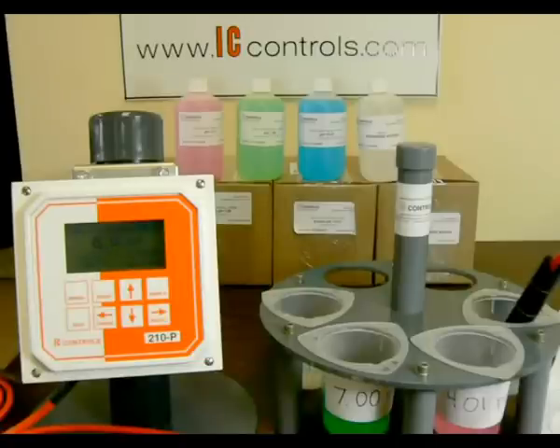After the pH buffer solutions have been used for calibration, IC Controls recommends discarding them. IC Controls also recommend storing your pH sensor in a pH 7 buffer or IC Controls pH storage solution when not in use. Calibrate your sensor each time it is removed from storage for the most accurate measurement.